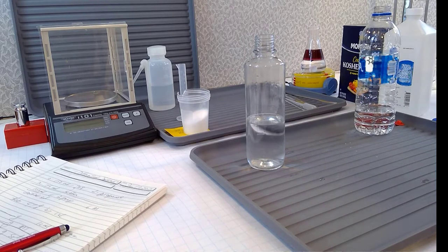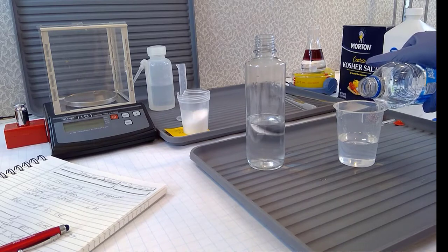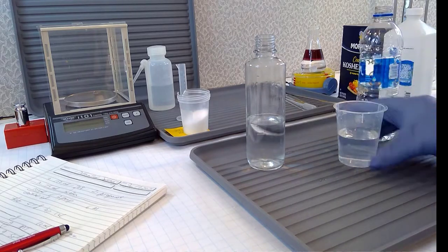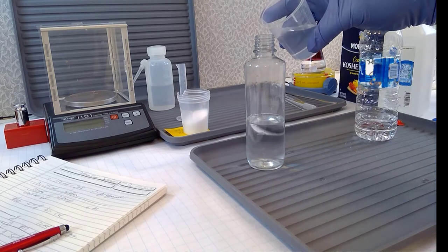Oh, 75. Oh, I read that wrong. I'm going to have to pour some of this water out. Oh no, I was going to get 75. Excuse me, and I wanted 75. I should have read my instructions that I had down. Make it 75, get it back to where it was. There we are. Yeah, 75 mLs of water.